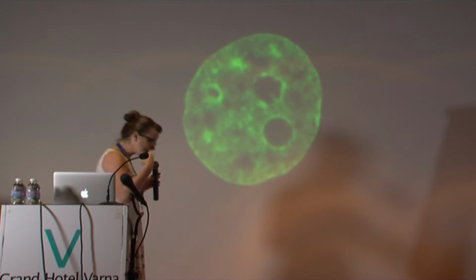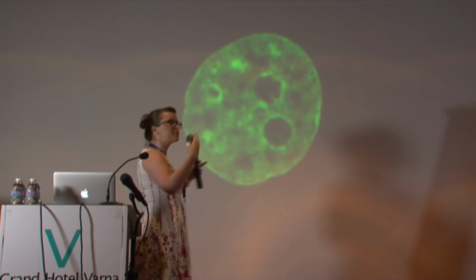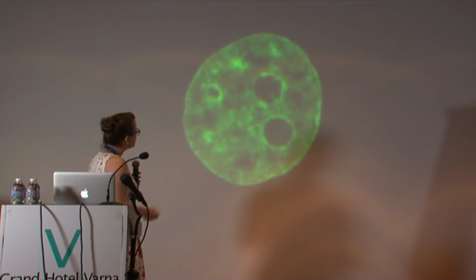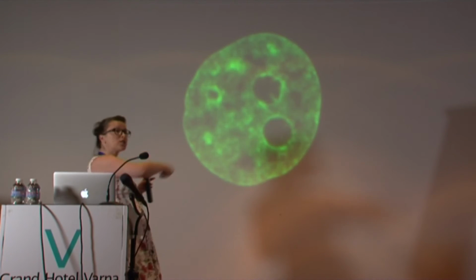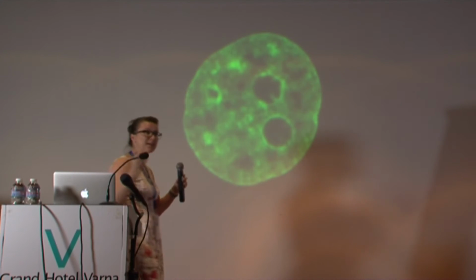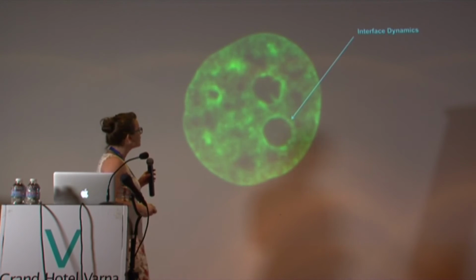We have been injecting particles ourselves, and one thing that we notice is that the cells tend to suffer when you use injection needles, since you cause a big hole. So we were trying to figure out an alternate way, and realized that the chromatin solution is actually filled with a number of subnuclear bodies, and we're learning about new ones every day. Why don't we use some of these little structures that are already present?